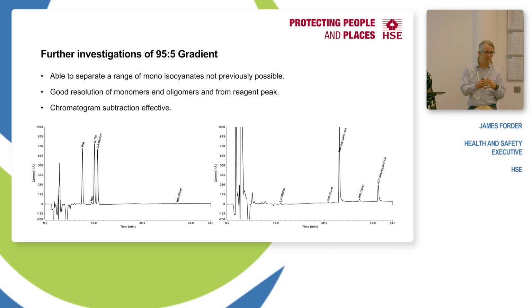Then they pour molten metal over it, and that MDI is heated to high temperatures and decomposes, and it makes monoisocyanate. Normally these can't be analysed by the isocratic method, but they could be analysed by the gradient method.